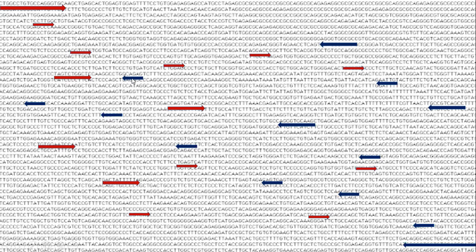And the medium and short fragments, given the repetitive nature of the DNA sequences, or given the human genome, with a lot of junk and repetitive elements in the non-coding region: if you make a small primer of any random sequence of ATGCs, of 8 to 12 nucleotides, it may go and bind randomly in a given genome. And this randomness is fundamental to understanding polymorphism also.